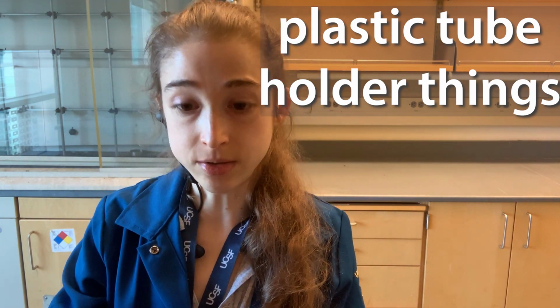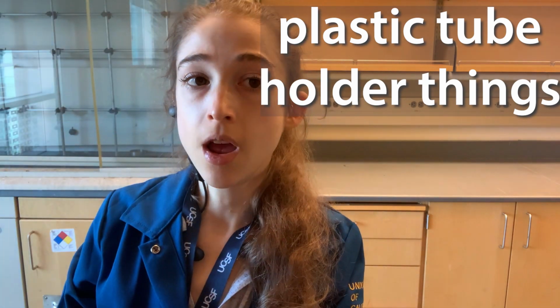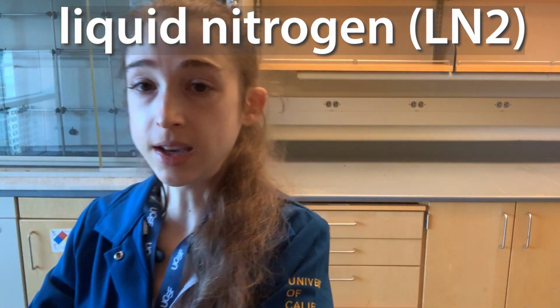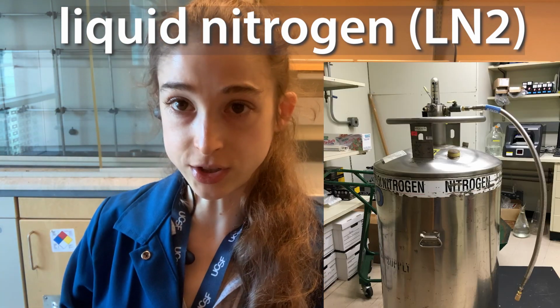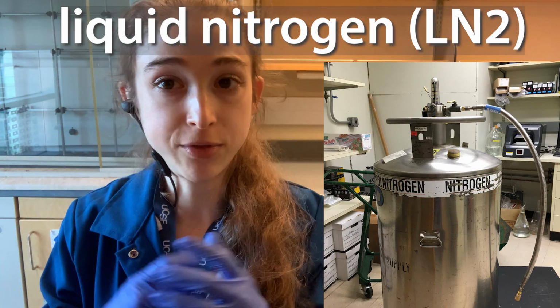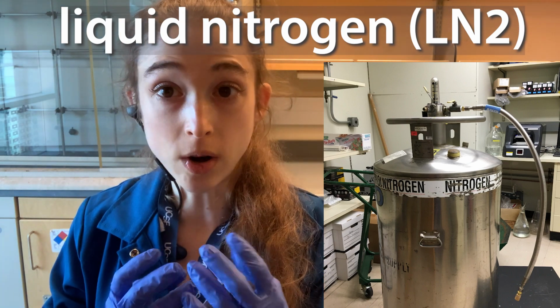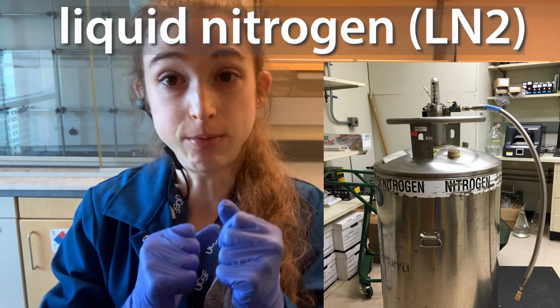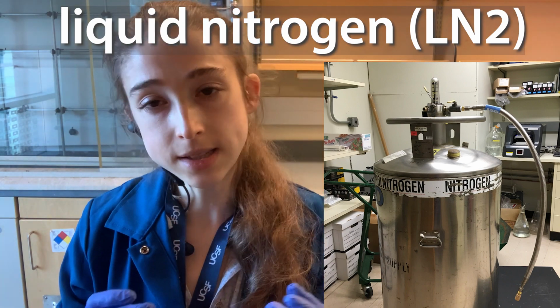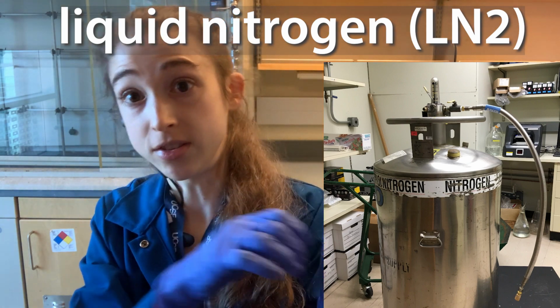These racks are also helpful if you want to freeze things in liquid nitrogen, which, speaking of liquid nitrogen, we can get things really, really cold with it. We often use liquid nitrogen for flash freezing or snap freezing. Basically, we get samples really cold, really fast. This prevents ice from forming, which could mess up our samples. It can also mess up the concentrations of things within the sample as ice is forming, where the water molecules are linking up together and excluding everything else.